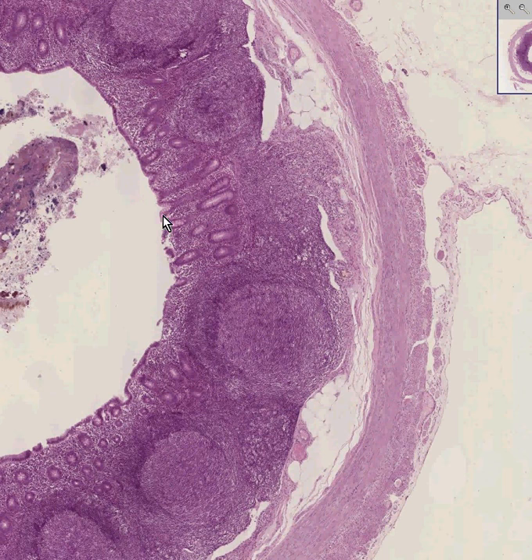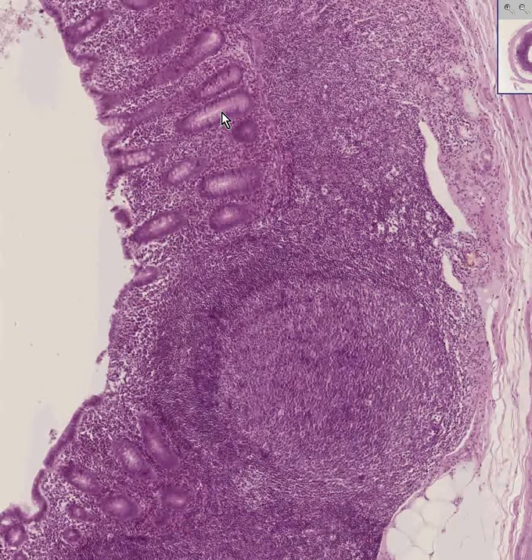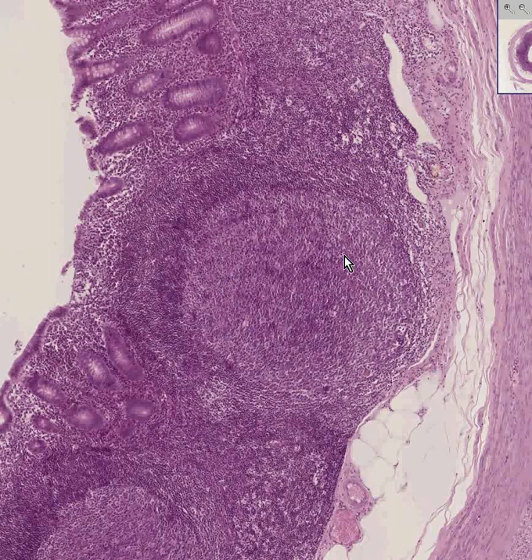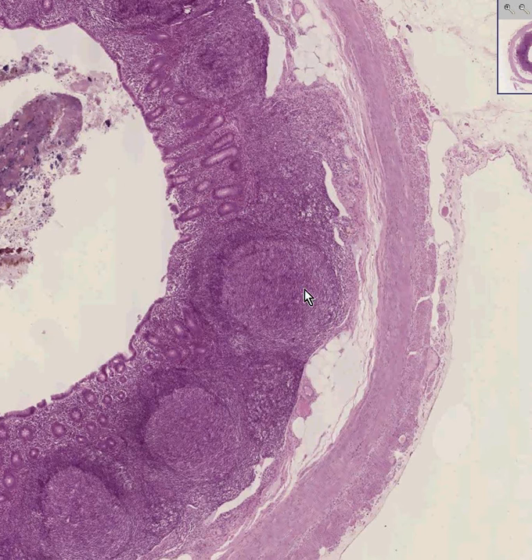The glandular elements that you see here, not only on the surface, but a little bit in, are mucus secreting cells, and they are simple columnar epithelium. Notice that there's a lot of lymphoid connective tissue between the surface and deeper epithelium. And in some areas, this lymphoid tissue forms actual follicles or secondary follicles, where you have lighter areas on the inside, the germinal centers, and then darker areas on the other side. Notice that this lymphoid area is actually the majority of the thickness of the appendix itself.